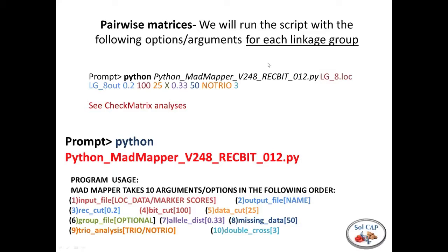The second thing we need to do within MadMapper is export the pairwise matrices, which we'll use in further analyses, such as check matrix. Again, we use the same script for MadMapper as we did initially for all the markers, but our input file is now our linkage groups, in this case linkage group 8. So it's exactly the same as before, but in pepper, for example, we have 12 linkage groups.